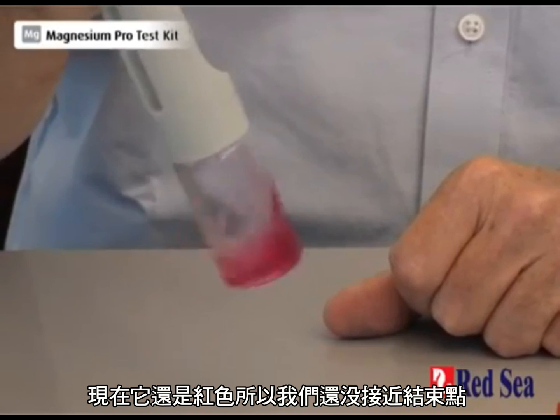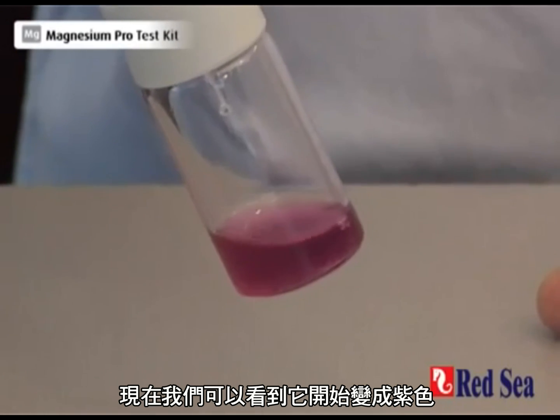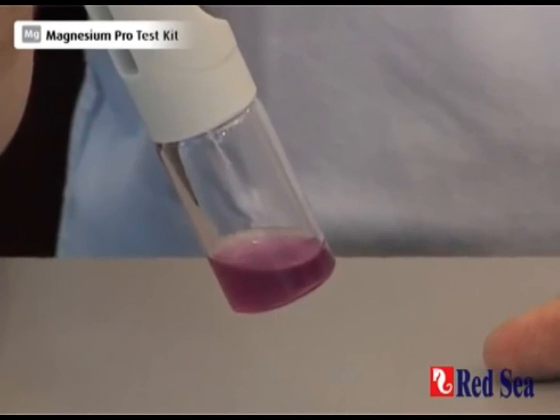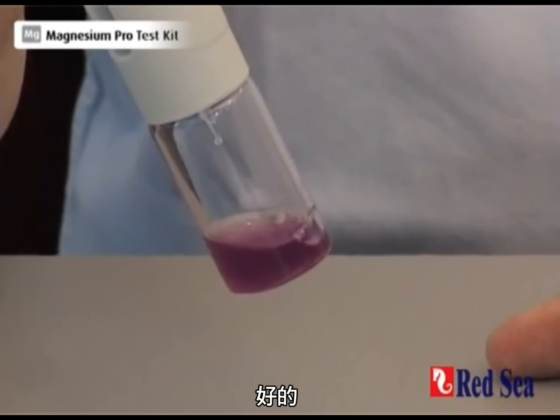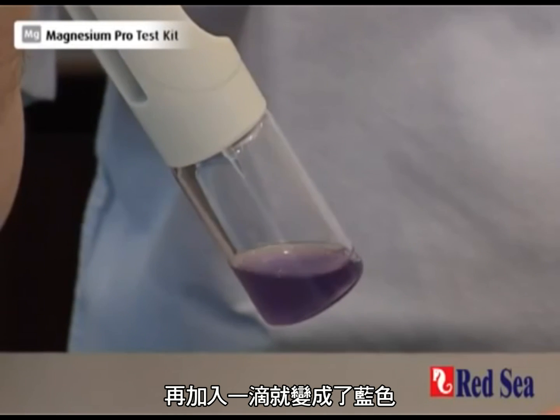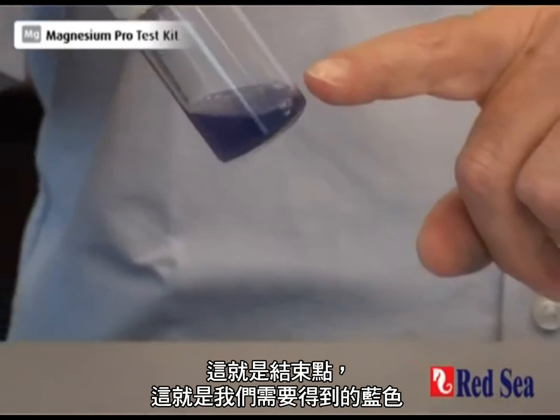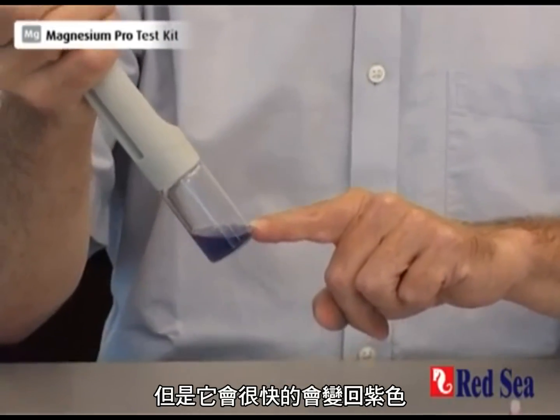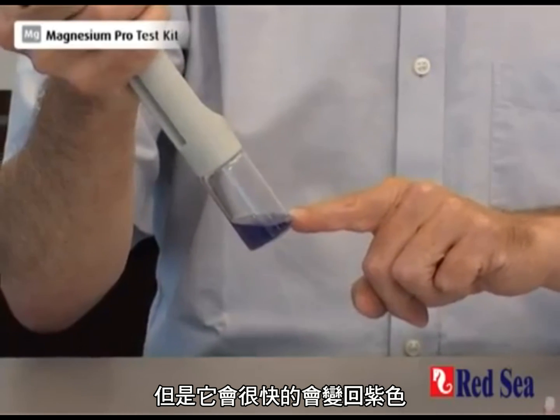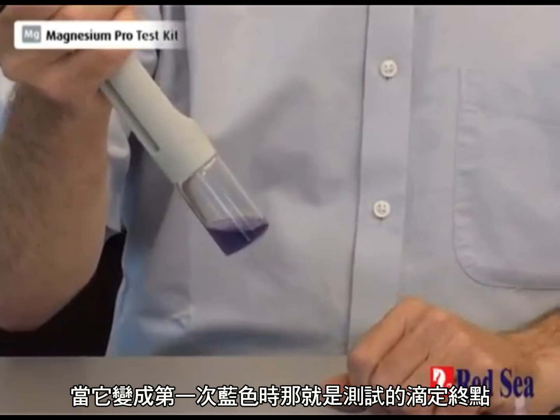We're still in the red so we're not even close. We're getting closer as the purply color is beginning to form. Almost there — and one more drop and we'll have our blue color. And there we go. This is the end point. This is the blue color you're looking for, but it's very quickly going to go back to a purple color. Ignore the purple color. The first time you saw the blue is the end point of the reaction.